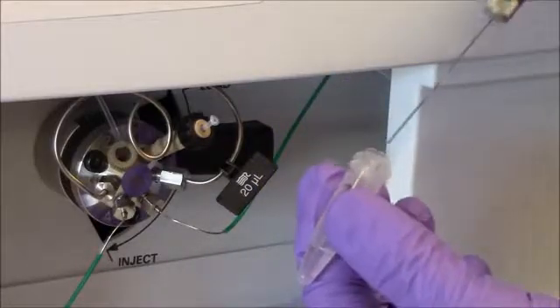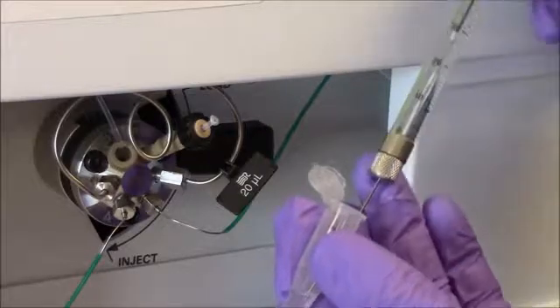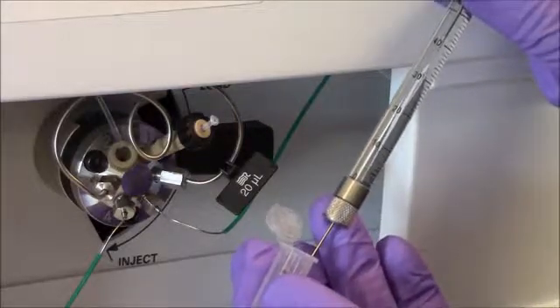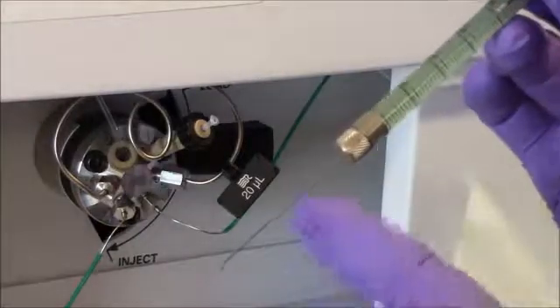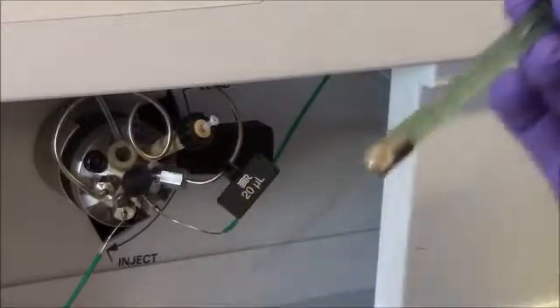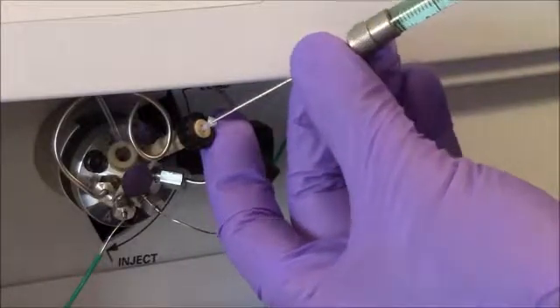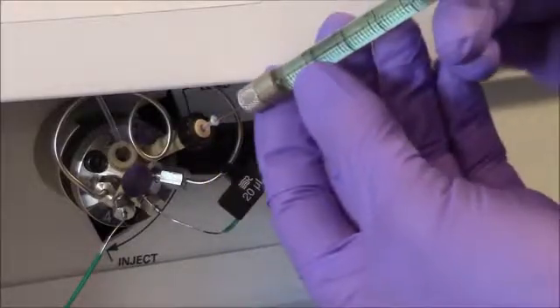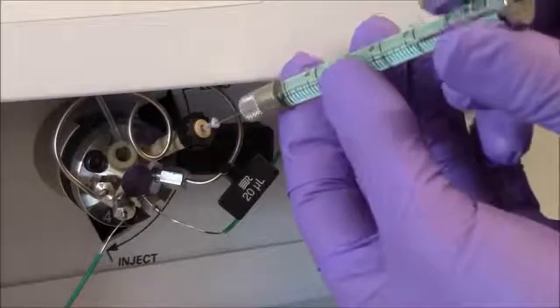So I'll pull up 40 microliters of sample into my syringe. I have little droplets on the outside of the needle, which I'll wipe off. And then I'll put the needle into the injection port, push it to the bottom. I'm not pushing it hard, it stops.